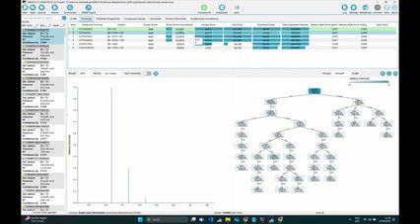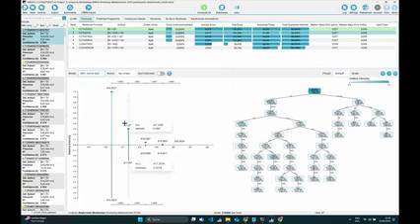So the first thing you have is the SIRIUS score, which is used to rank these formulas. Then you have the isotope score, which tries to look at the isotope pattern, the detected isotope pattern, and the predicted isotope pattern, which you can see if you click here on mode on MS1 mirror plot. Then you will see in the top the detected isotope pattern, and in the bottom you will see the predicted isotope pattern. And this isotope score reflects how well these two patterns match. This is the first indication on whether our formula is good.